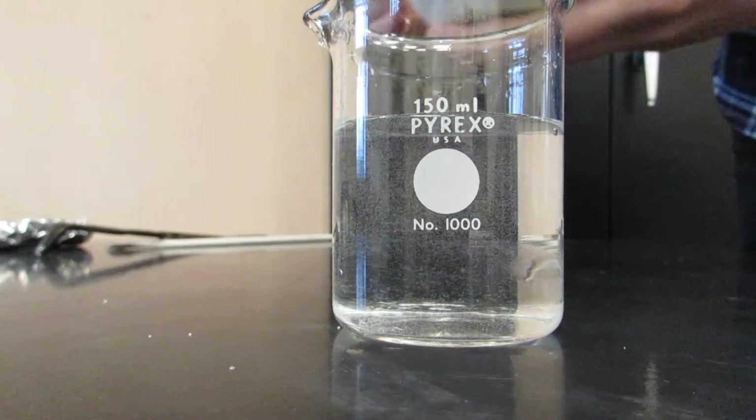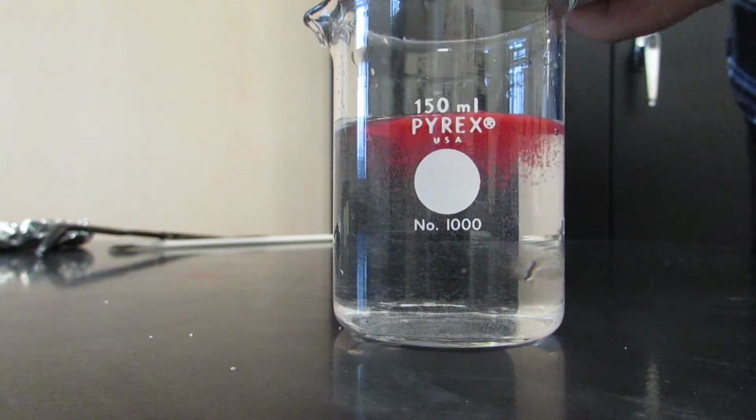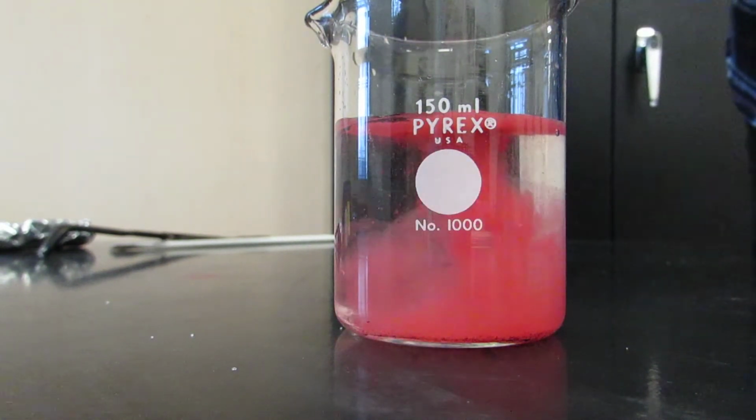For the last experiment, we are going to take the crushed chalk that we have and combine it with water to see what happens.